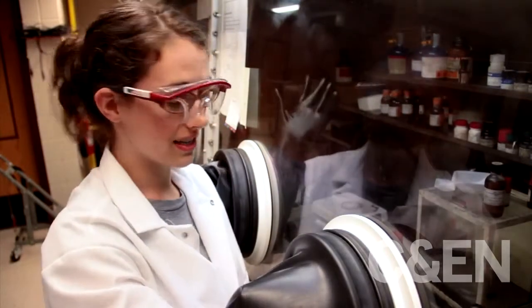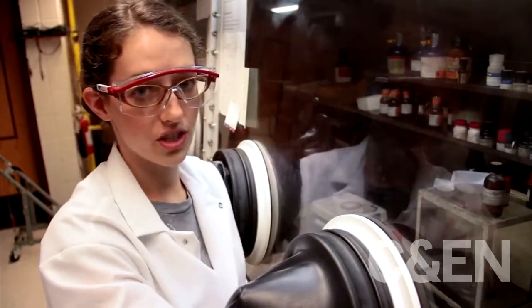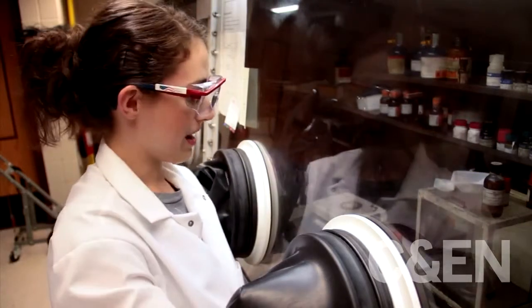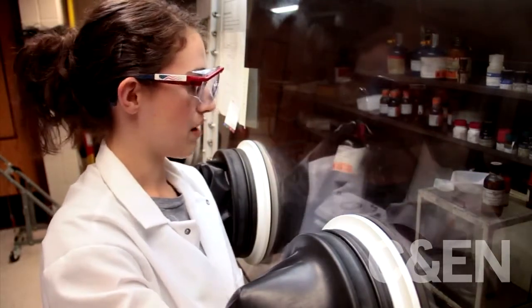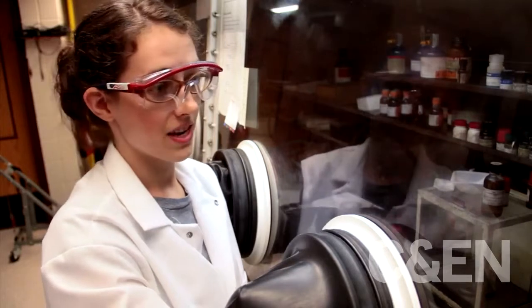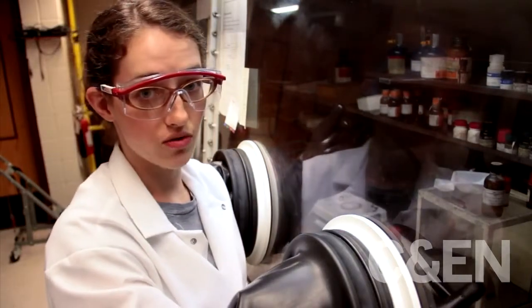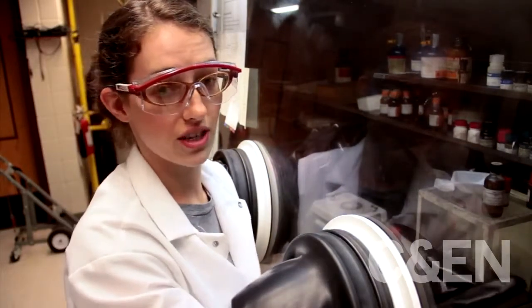So I'm getting two things in here. The first is selenium, which is in powder form. And then I'm going to dissolve that in tributyl phosphine. I'm going to take that, split it between two syringes, and head back over to do the injection.